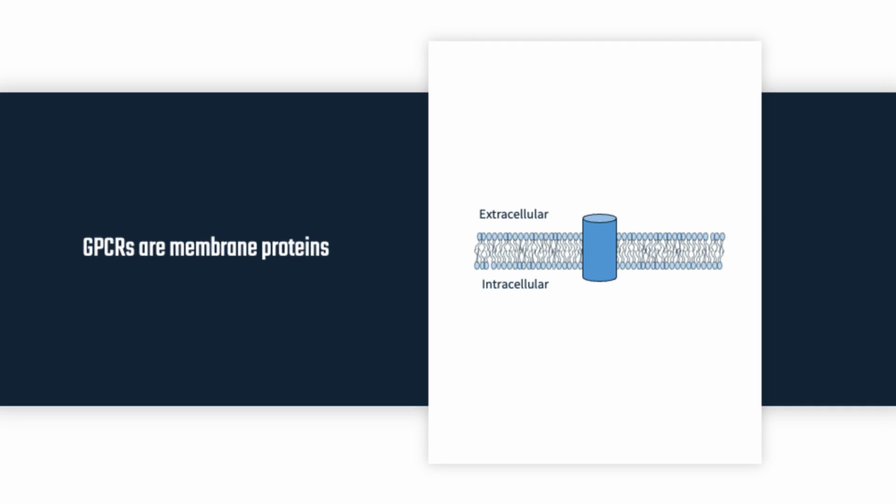Also, generally speaking, detergent could contaminate your instrument. It is important, while you are measuring one interaction, and at the end of your interaction measurement, that you make sure you don't have any residual detergent present in your instrument, and that it's well cleaned and that the microfluidic part of your instrument is not contaminated.